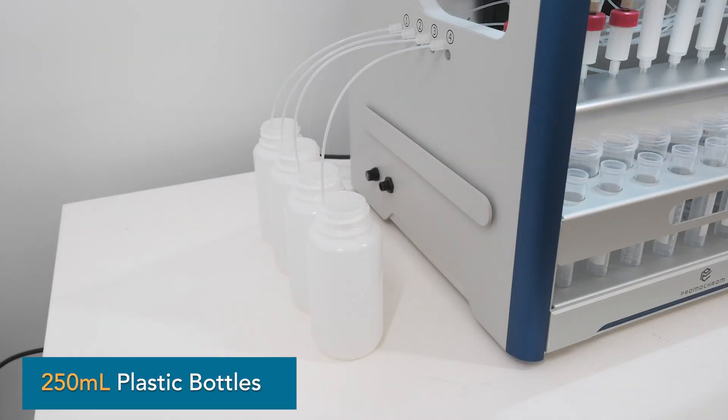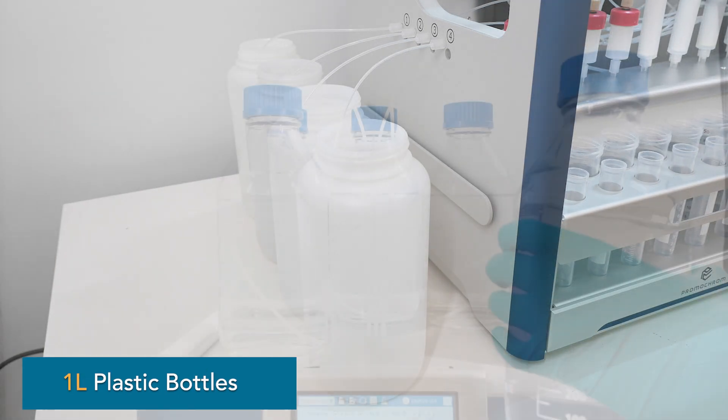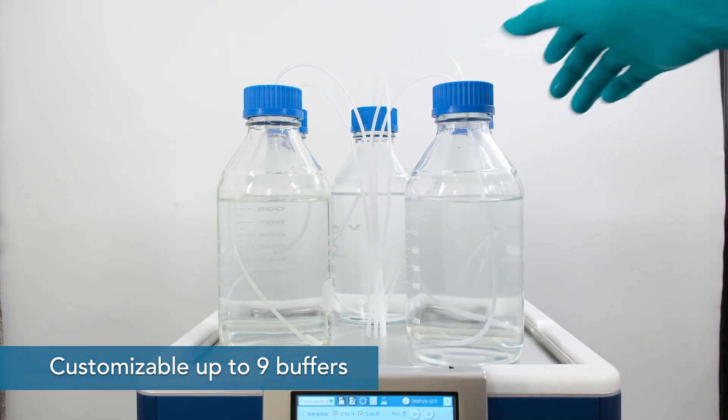You can add samples of any size up to 1 liter. Choose from up to 7 buffers to use for your purification, which can be further increased to 9 if necessary.